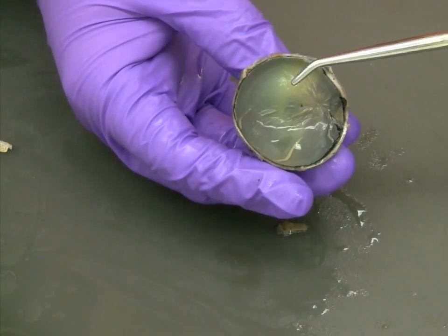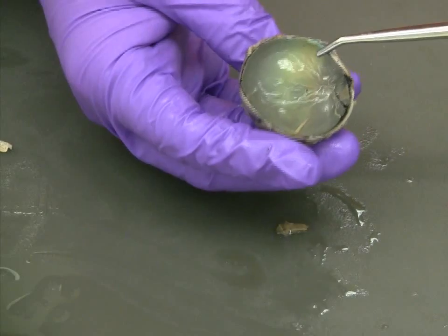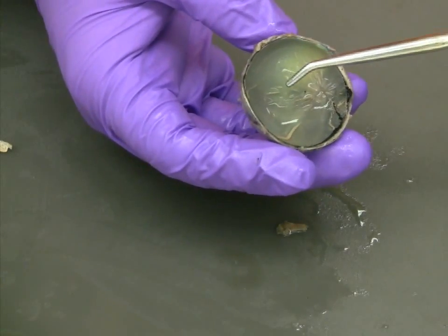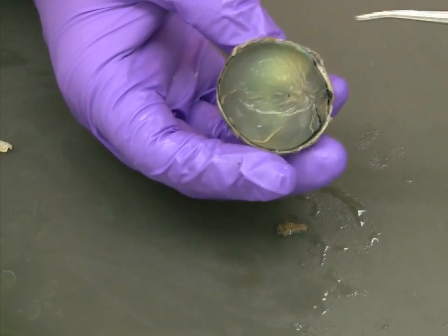Another structure to note on the retina, which may or may not be visible in your specimen, is the fovea. This is a small depression in the retina which is located near the blind spot. When compared to the rest of the surrounding retina, the fovea has a unique proportion of rods and cones.